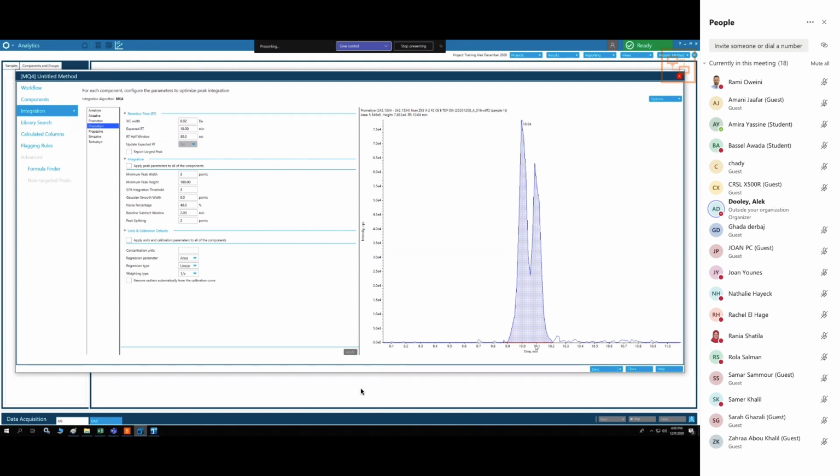As you saw from the MSMS vector, we had that difference of the 186 versus the 200. 186 was the daughter only in one of the compounds, and 200 was the daughter only in the other. So we could use the MSMS information.